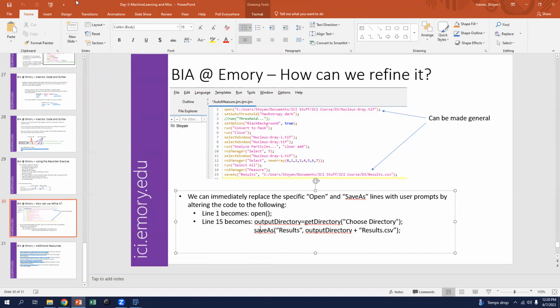Yeah, so sometimes, I don't try to select this when we say that. Normally, if it detects that the image needs some questions answered on how it's going to open it, it'll prompt you for it.